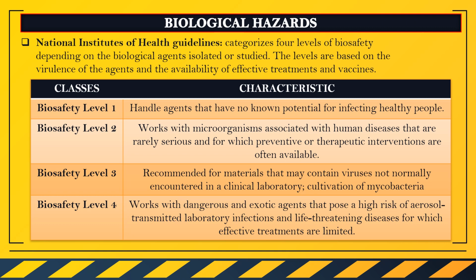Biosafety level 4 works with dangerous and exotic agents that pose a high risk of aerosol transmission, laboratory infections, and life threatening diseases for which effective treatments are limited. One example is the COVID-19 infection.